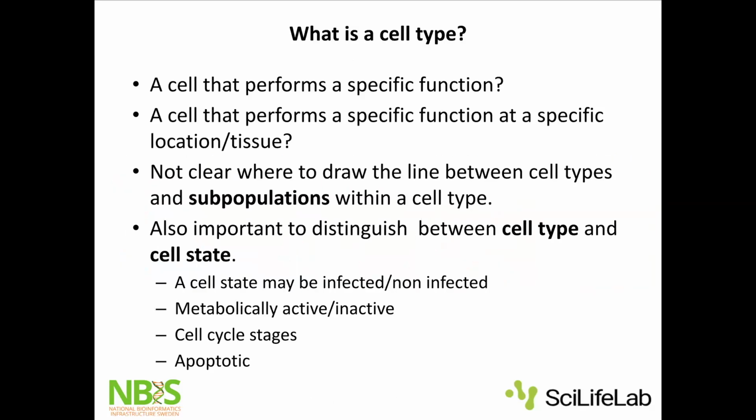So yes, as I said, it can be anything that performs a function or has a specific location. We can talk about both cell types and then subpopulations of cell types, and then cell types that have a specific state.